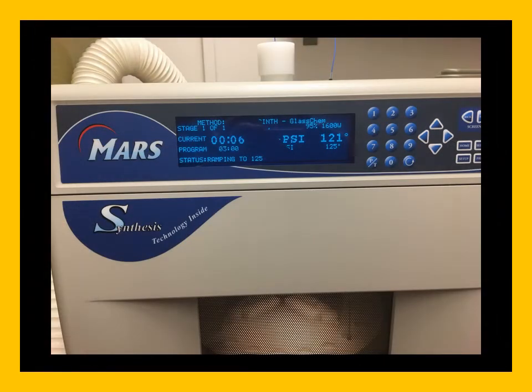We have now started the program. You can see, if you look carefully, you can see our tray. You can see that if you look carefully right here, you can see the tube, the probe that is measuring the temperature within our vessel. The microwave has been running for almost 3 minutes now, and it is currently at 121 degrees. Now this is 121 degrees centigrade.